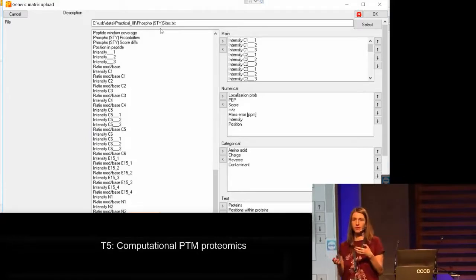modification forms is that you can actually argue that they may even have different functional relevance, right? You can say that, okay, if it's just one site modified, then the function of this one modification is X, or maybe, let's say, it's activating the protein, but if you have both of them modified at the same time, then it has an inhibitory role, just hypothetically speaking. But that's the idea behind distinguishing all of these different possibilities.